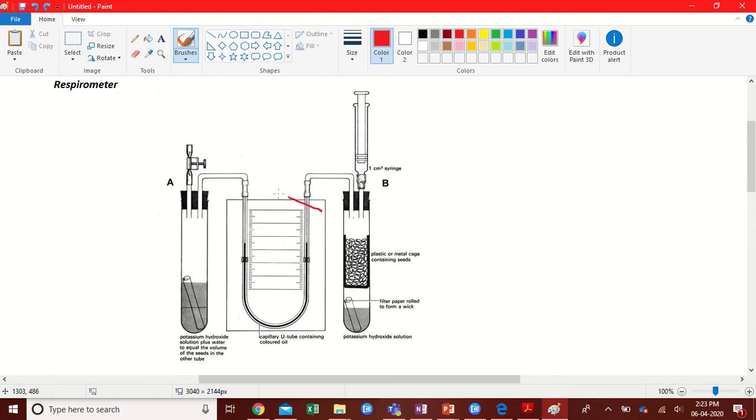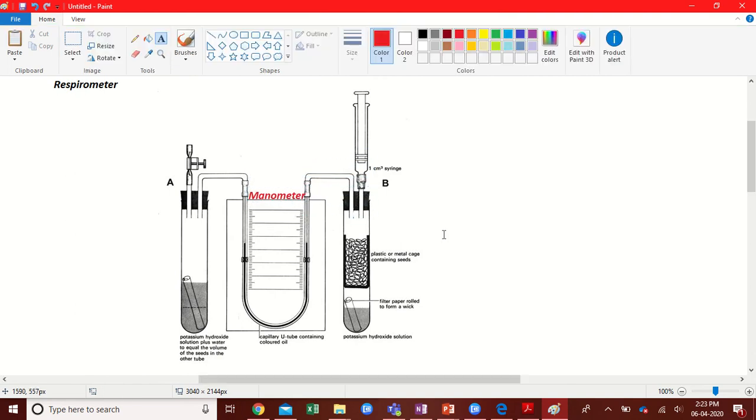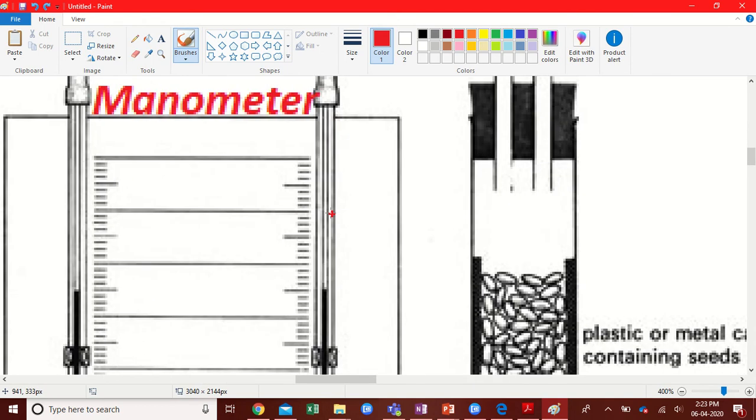This piece of apparatus in the middle over here is known as a manometer, not something to measure how manly someone is, but a manometer. So that's something that just measures pressure changes and things like that. So what's happening is oxygen's being taken in by the seeds. So I'll just draw that, O2. That's terrible. Let's zoom in. There we go. So O2 is going to be taken in by the seeds.